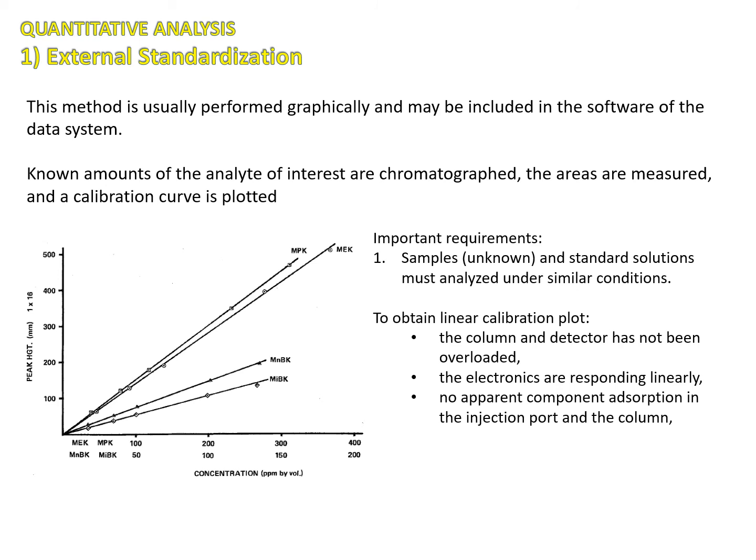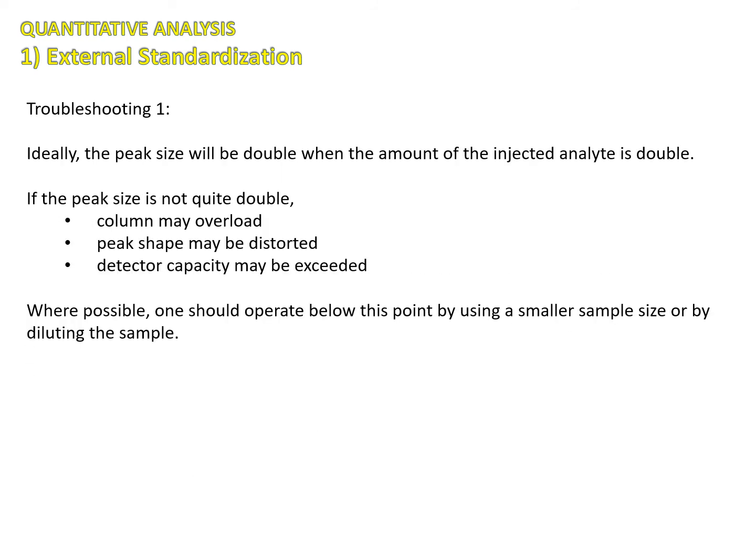So that we can use the calibration curve to analyze the samples. Basically here, class, we will get the straight line equation, which is y equals mx plus c. By using that equation, we can calculate the concentration of the unknown samples. This is the external standard method.